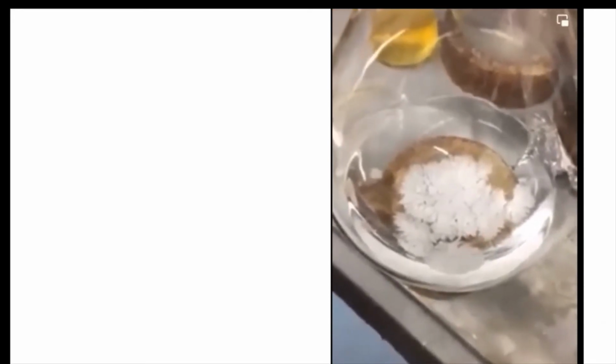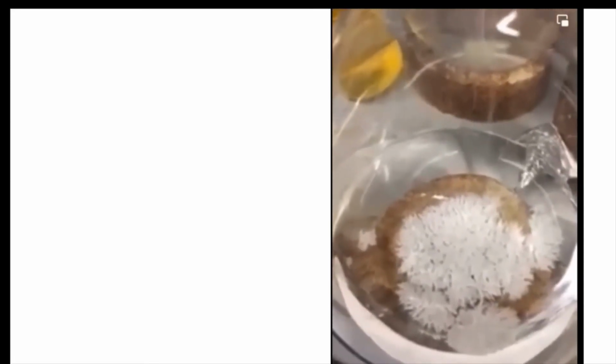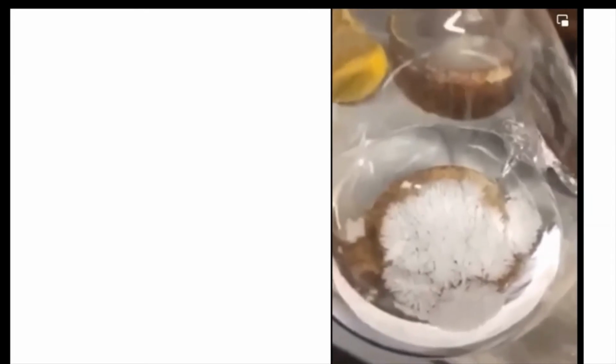In many cases, the compound can be soluble in acetonitrile. In that case, you cannot do the recrystallization from acetonitrile. But compounds which have many aromatic rings normally do give crystals in acetonitrile, and sometimes you may add a little bit of DCM just to dissolve them in acetonitrile. And if acetonitrile doesn't work, then try ethanol. Sometimes ethanol gives you a very nice crystal.